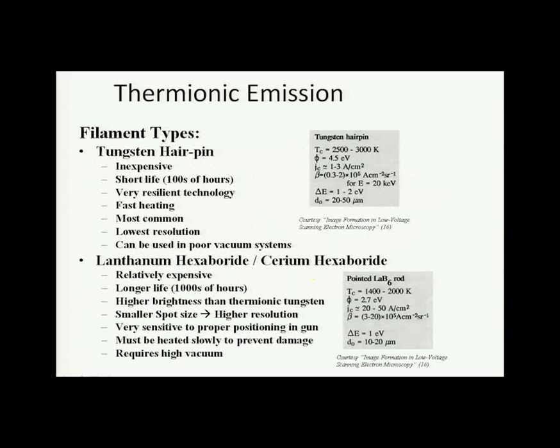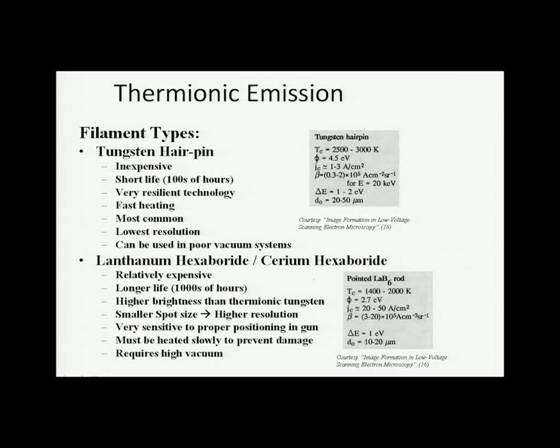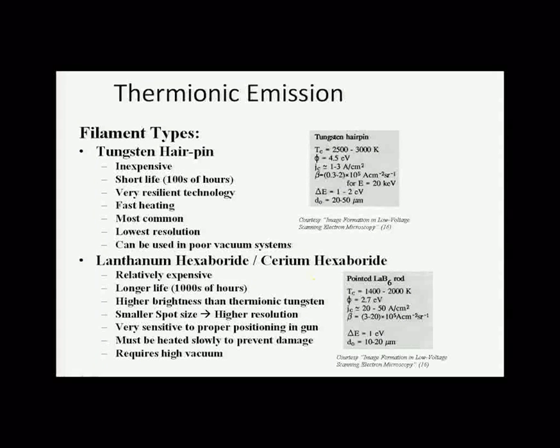So there are multiple filament types. There's a tungsten hairpin filament, often used because it's inexpensive, but it does have a short lifespan within hundreds of hours. It's fast heating, it's the most common, it's also the lowest resolution. But it can also be used in poor vacuum systems, which is a bonus.